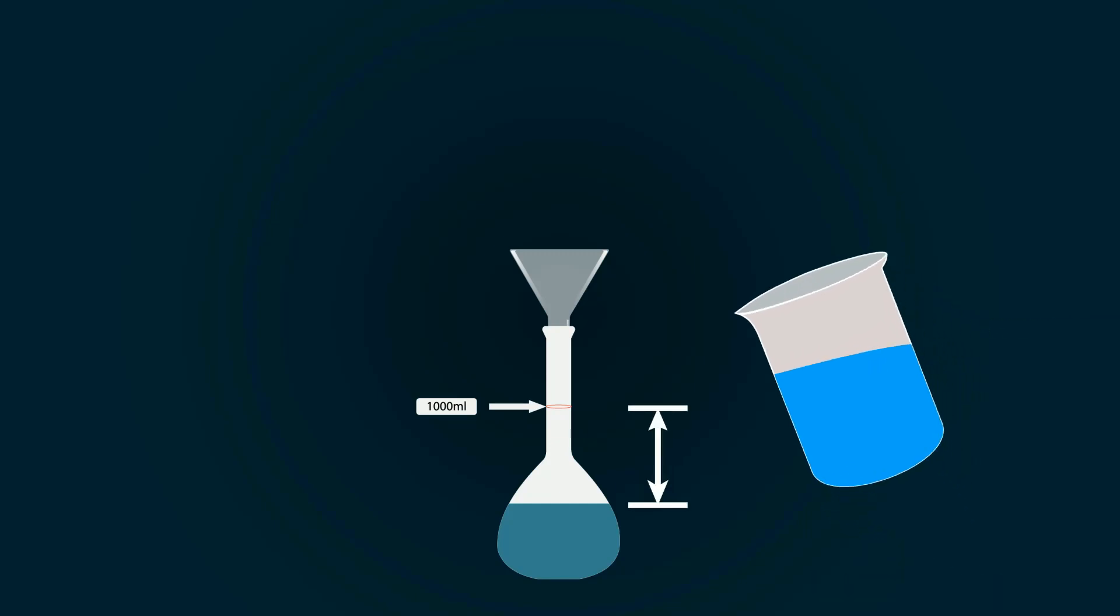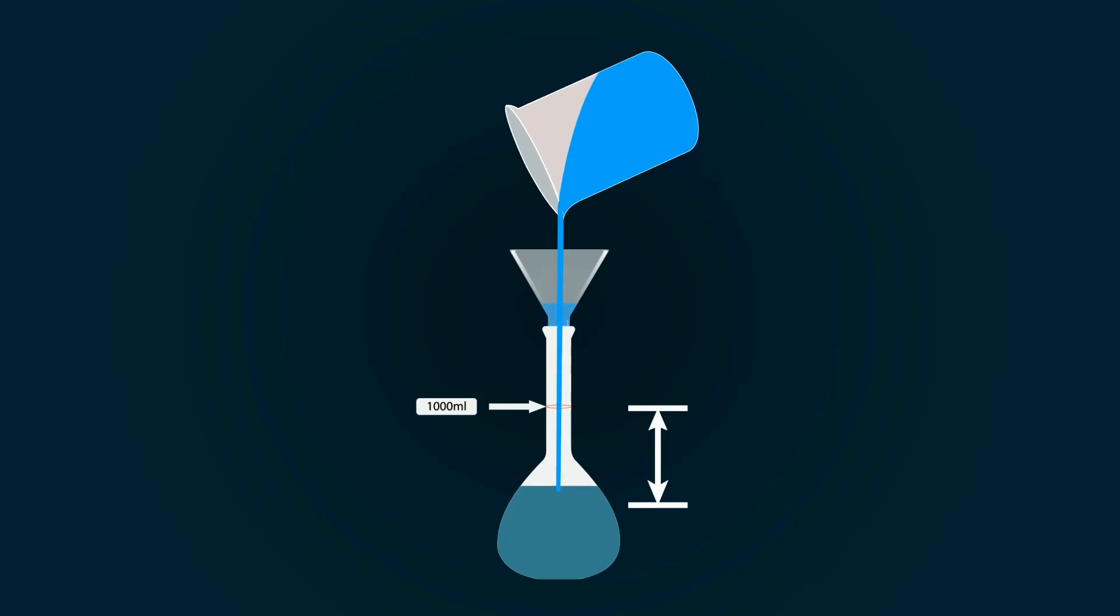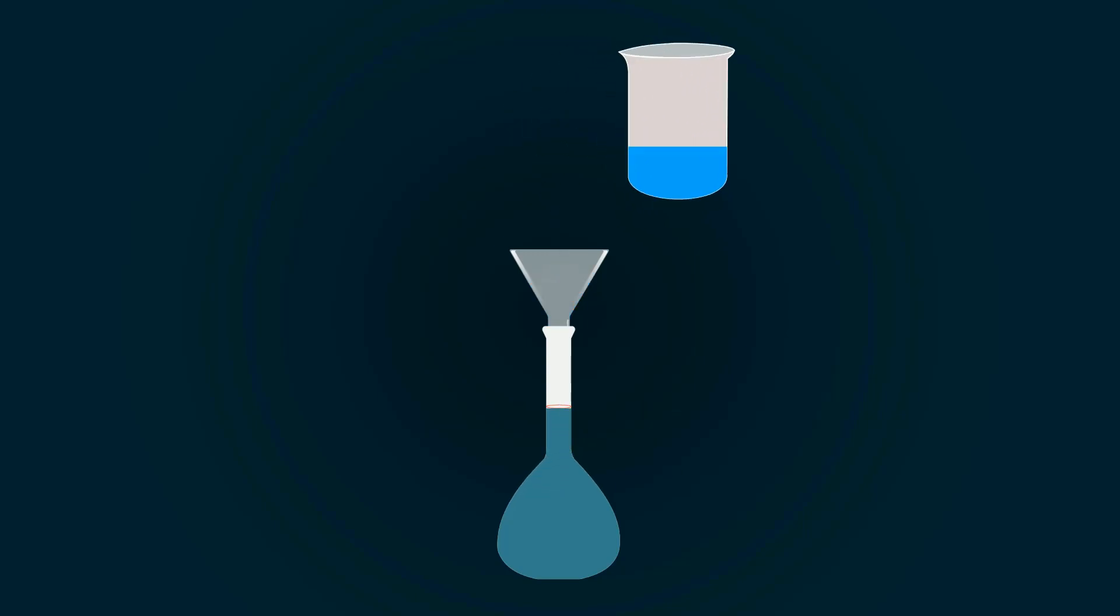Add more distilled water and fill it up to the 1000 ml point.